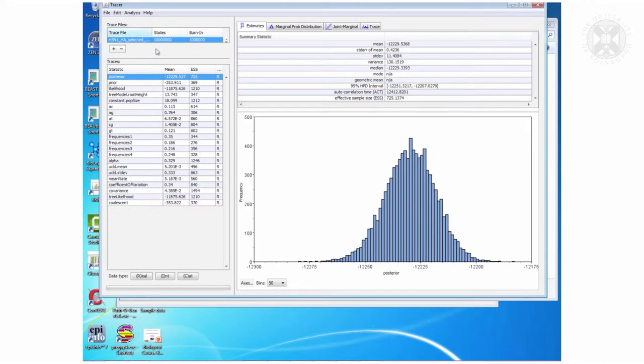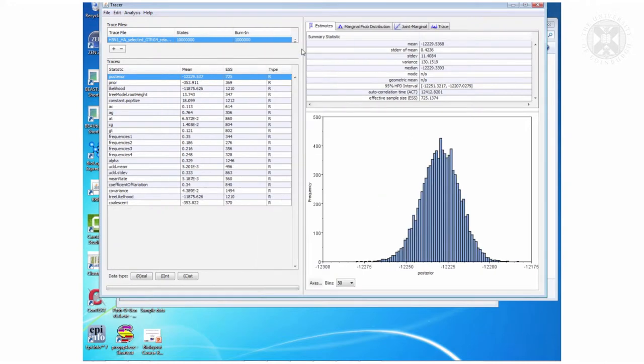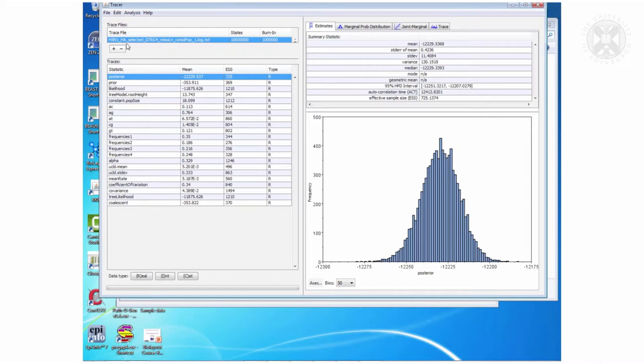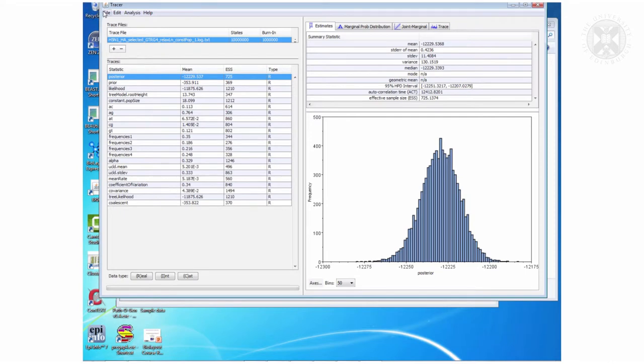And then from here I can open another one as well. So this was the GTR model with a relaxed log normal clock and constant population size.